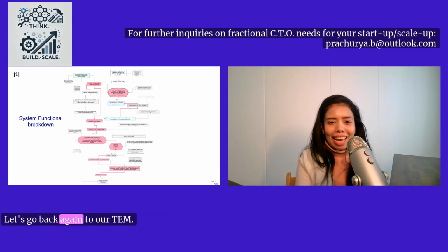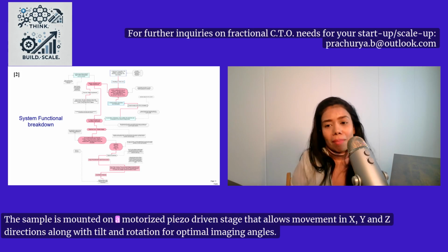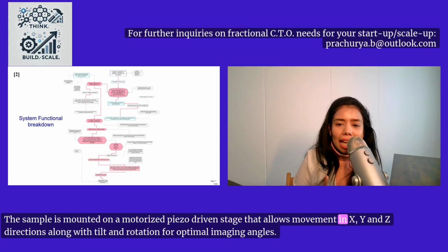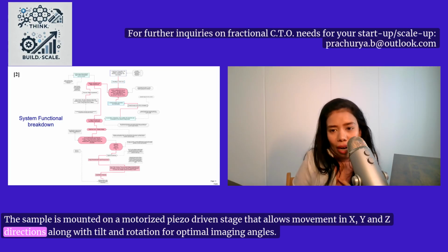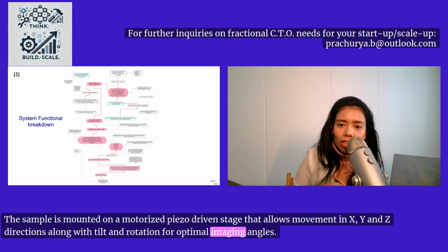Let's go back again to our TEM. The sample is mounted on a motorized piezo-driven stage that allows movement in X, Y, and Z directions, along with tilt and rotation for optimal imaging angles.